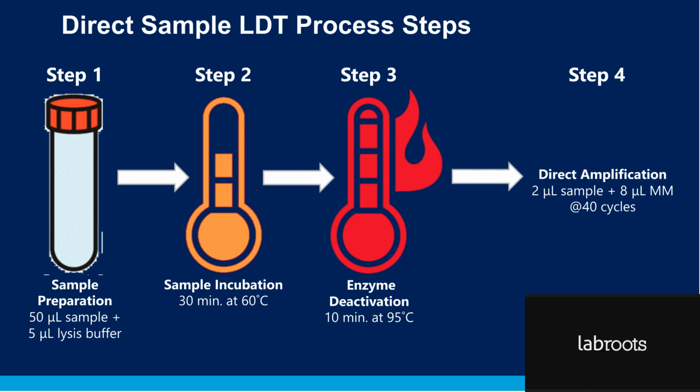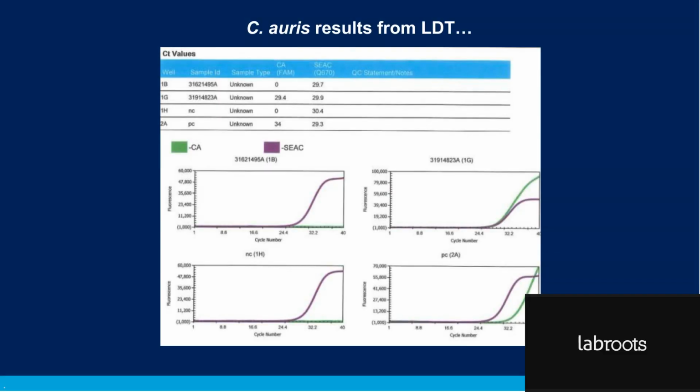plate, using 2 microliters of sample and 8 microliters of master mix. So as I said, we tried a few things, but this seemed to be working pretty well, and I'm showing you here some examples of results where you can see the amplification curves.